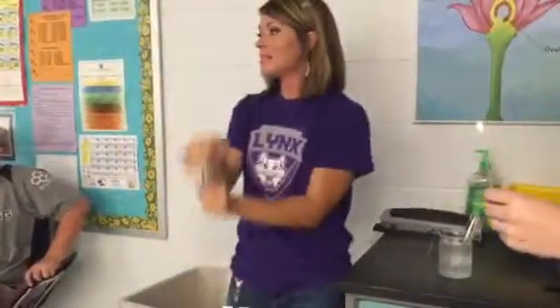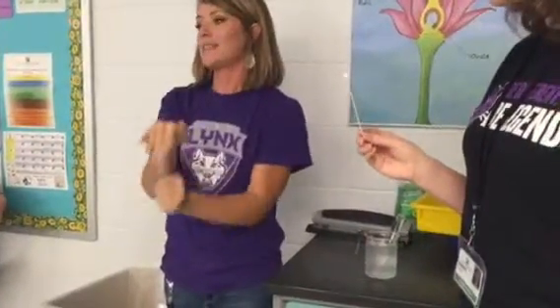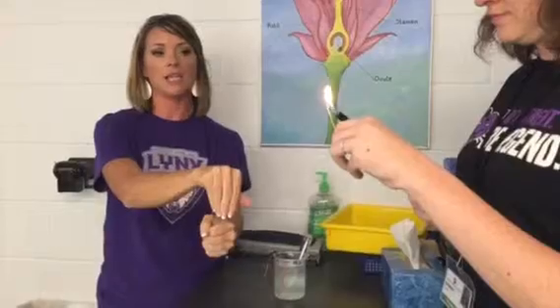Because it's less dense than the other gases in there, it should come up to the top when I shake it. And since it has the property of being flammable, when Miss Kim puts that flame over here, we should be able to ignite the hydrogen.